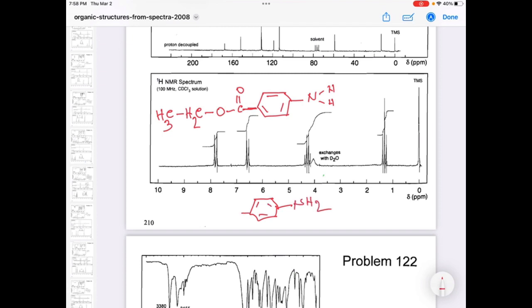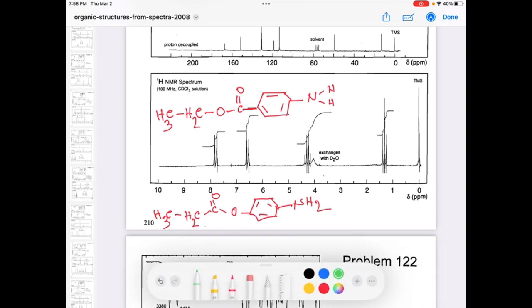Now you might say, what if we have a structure like this? Suppose NH2 is okay, but what if we also think like that: we put oxygen first, and then we put CH2 and then CH3. So that is also a kind of close structure, right? But how can we confirm that the top one is the correct one? Why not the bottom one?